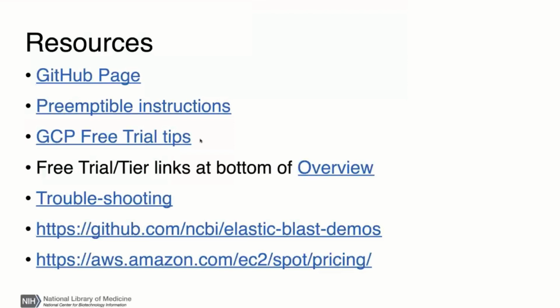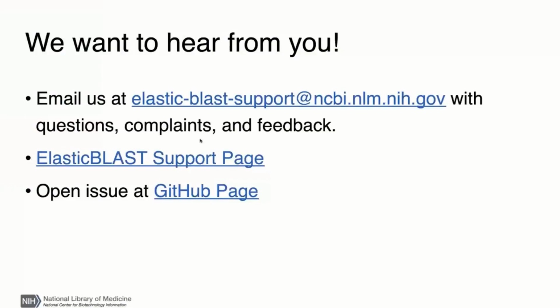We've tried to include all the programs. We might have a few we have not done, like Delta Blast and such. There are still some options in ElasticBLAST that are missing. For example, you can't limit your search by a GI list. This came up recently. These are things that could be implemented if we hear back from people that, hey, I think ElasticBLAST is good, it works well for me, but I need you to implement this.